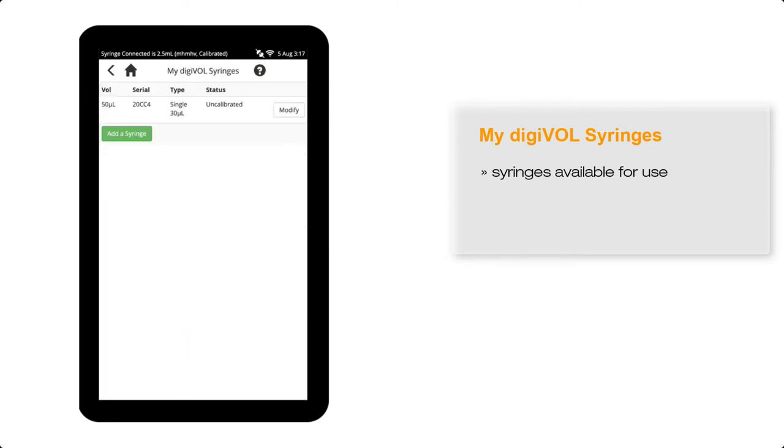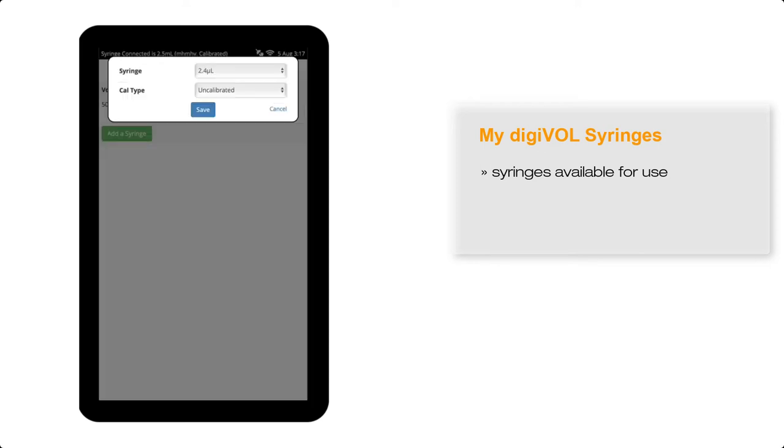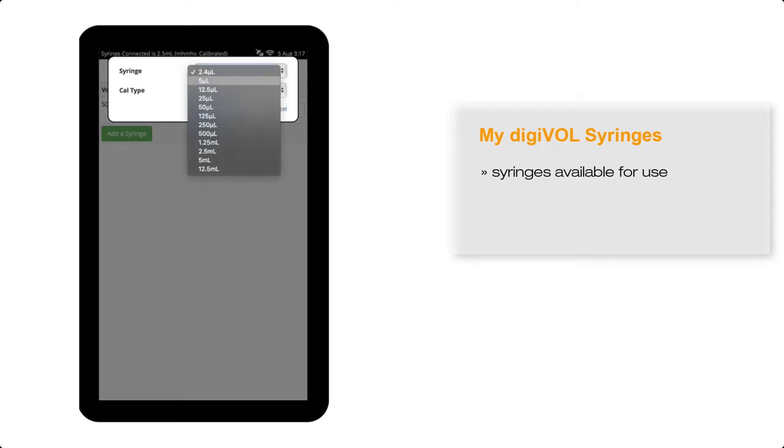I have a 250 microlitre syringe available to me, so I'll add the syringe by selecting Add a Syringe, and then in the drop-down list, I'll select the 250 microlitre syringe.